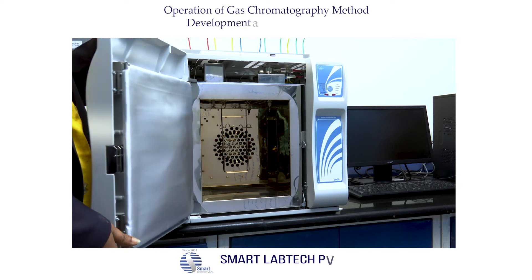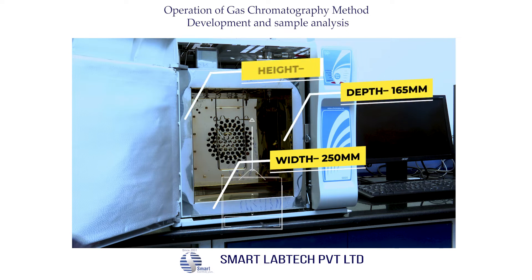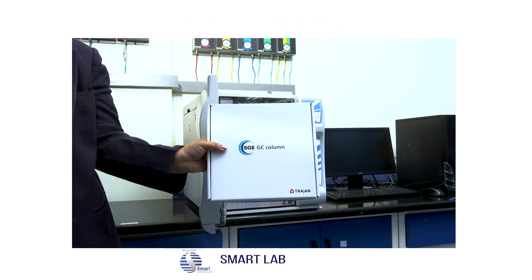This is the column oven compartment — let us open it. The width of the column oven compartment is 250 mm, the depth is 165 mm, and the height is 290 mm. The column oven volume is 12 liters. This GC can accommodate three columns at a time.